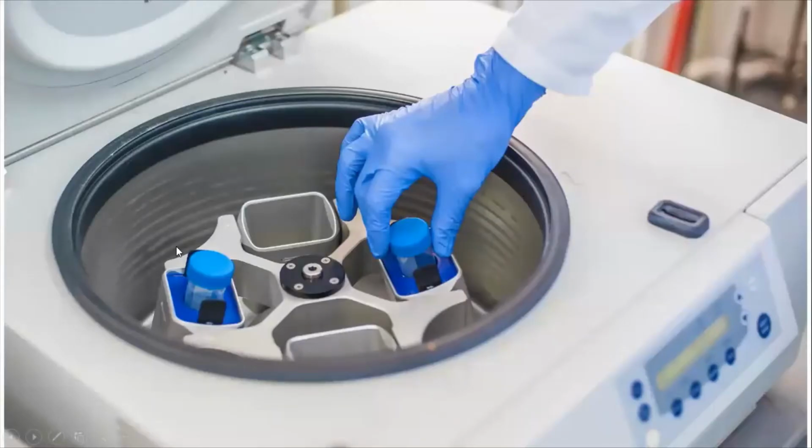So this is how, can you see? So there are two. So this is one centrifuge. Can you see? Looking at this cover itself, I can say that this belongs to the Tarson company. Okay, so they have got the blue cap and this white area.